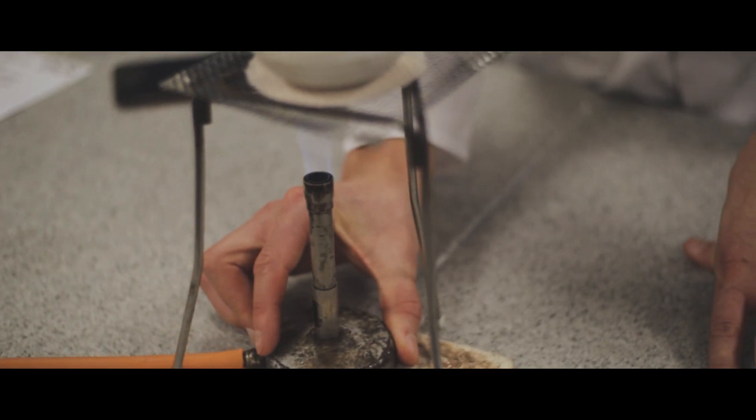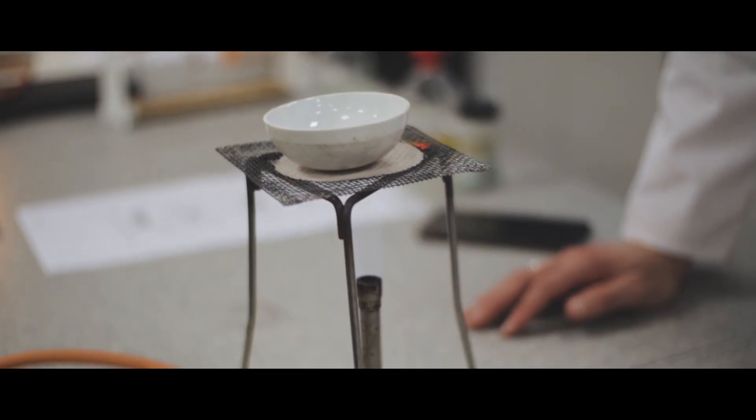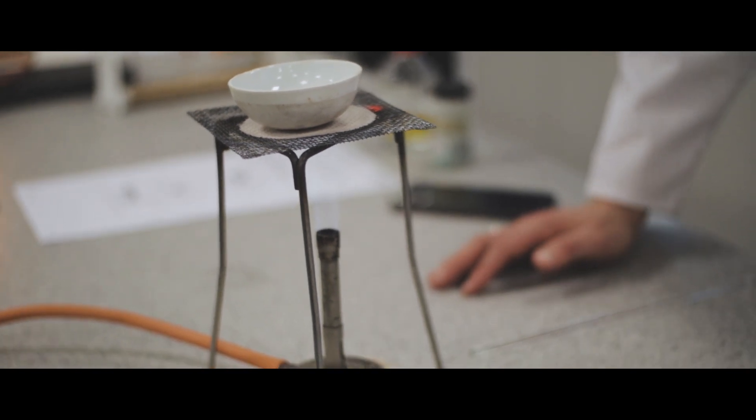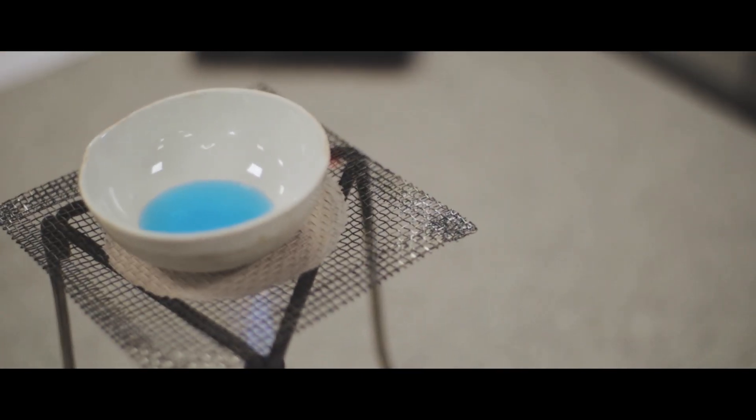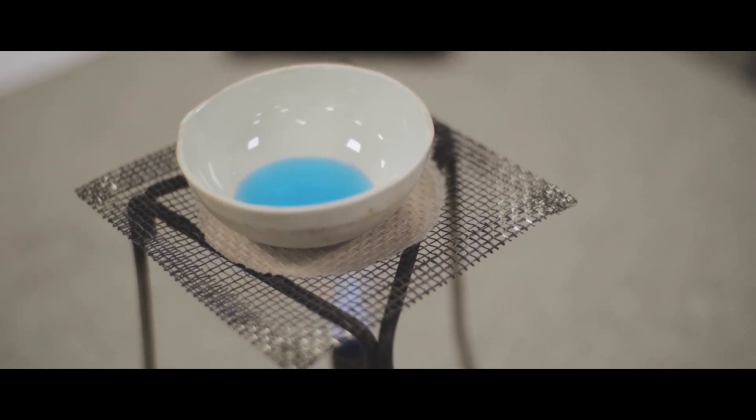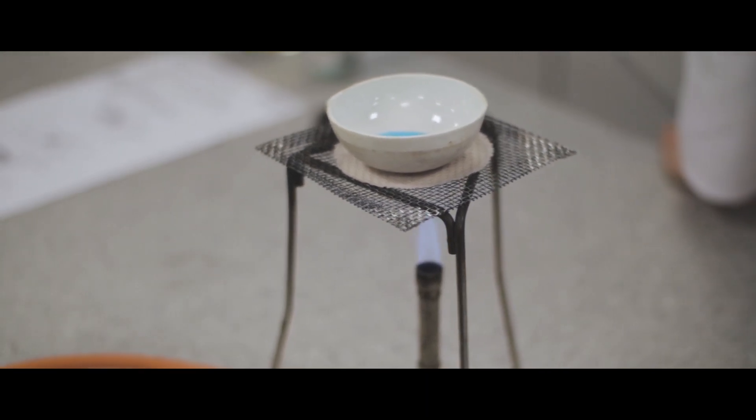To get the nice deep blue copper sulfate crystals, we don't want to heat it completely dry. The blue crystals are actually hydrated copper sulfate. If we heat it too strongly, we'll get white copper sulfate. So we want to stop heating when most of the liquid has been removed and then allow it to cool more slowly to leave those nice blue crystals behind.